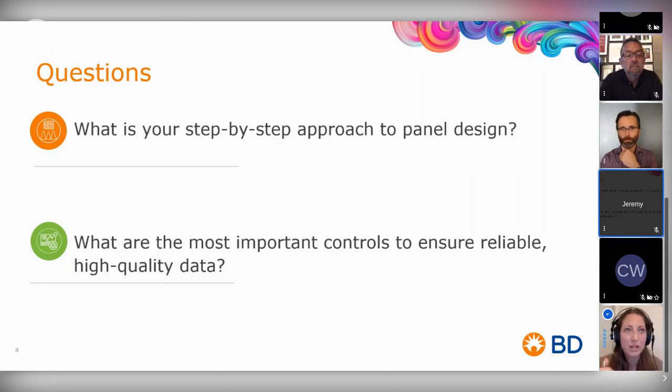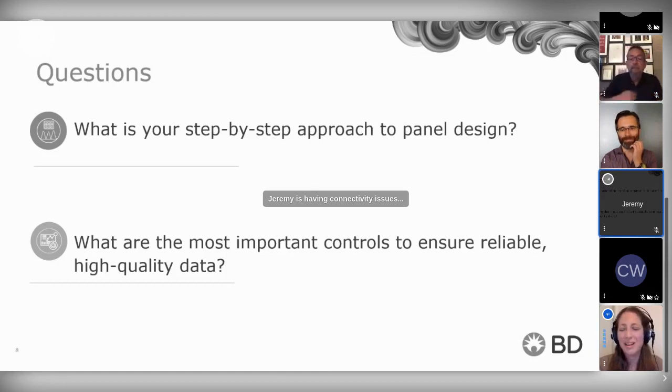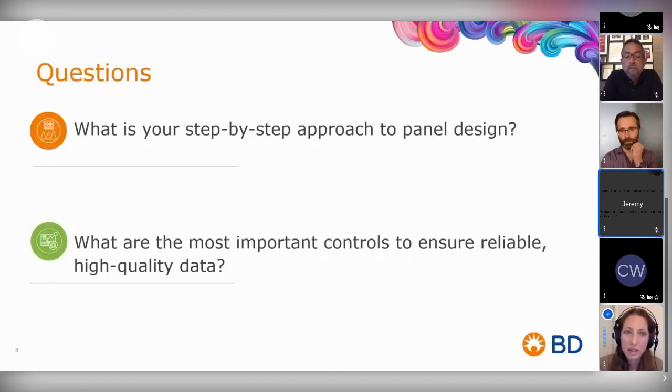The FMO can't really tell you that because the negatives are usually also affected by adding in that extra test antibody. Sorry. So the threshold might be a little higher than your FMO would indicate. And so people like to use isotype controls, which I would not recommend at all. Again, all of those controls have their place, but as we mentioned, you need to really understand what every reagent or every technique or every filter does for you.